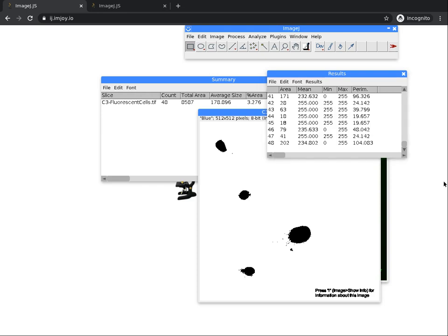Congratulations, you were able to analyze objects in an image. This task concludes our Getting Started with ImageJ project. You could install the software, download images, modify them to better analyze them, and analyze elements or objects in your images. From now on, you can use the software for scientific or professional or even personal purposes, and you can process all your images to extract essential data quickly, easily, and for free.